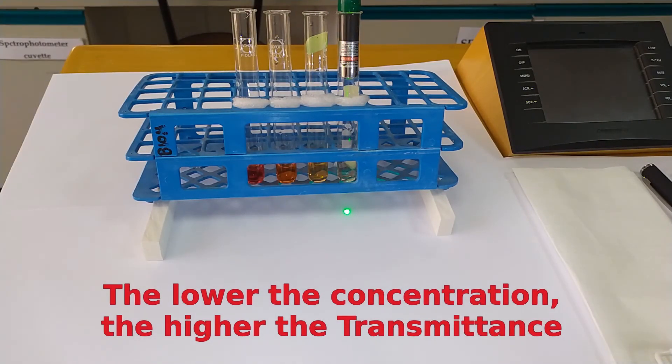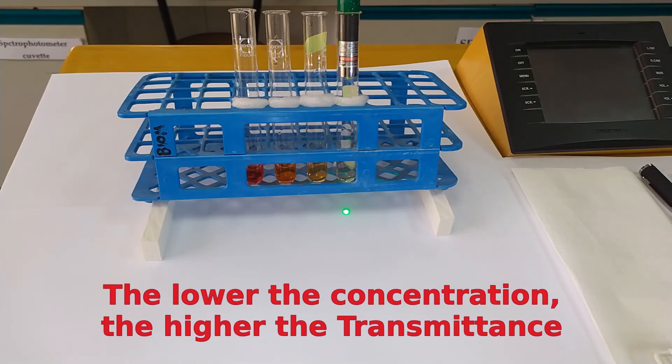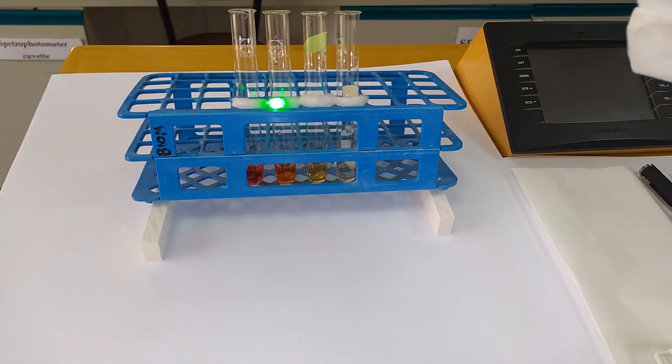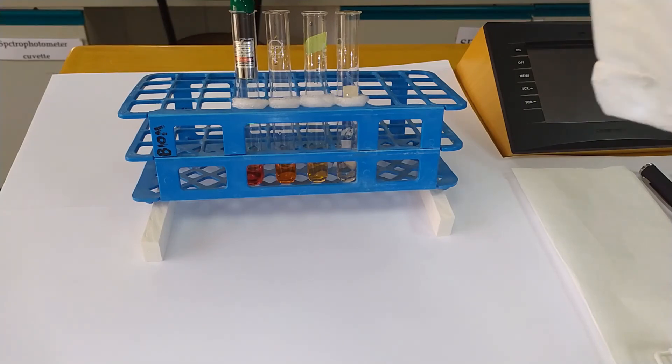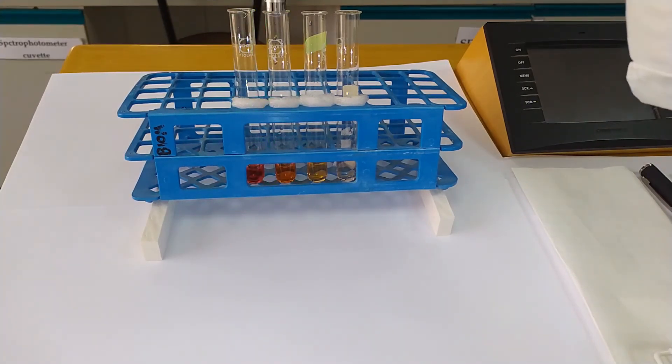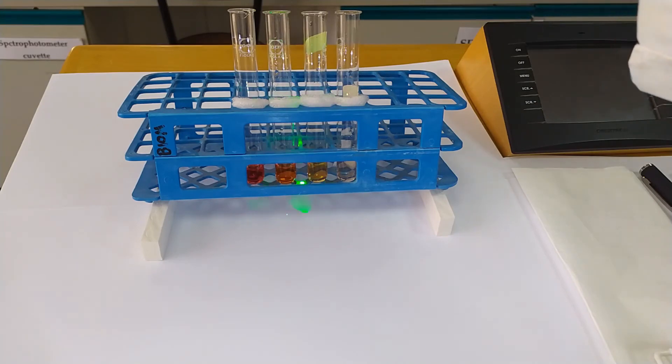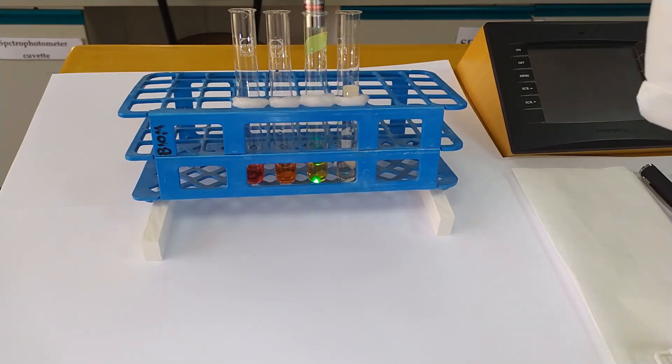Okay. So, the less of the color there is, the fewer of the red molecules there are in solution, the more of the red light is able to pass through the actual sample. And so, this is how we can actually measure how concentrated a sample is. If we have no light passing through, it's very concentrated. If we have some light passing through, then it's somewhat concentrated. And again, the more light passes through, the less concentrated the sample is.